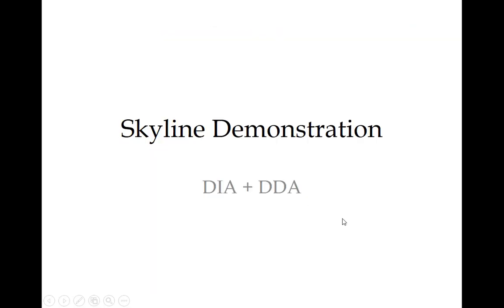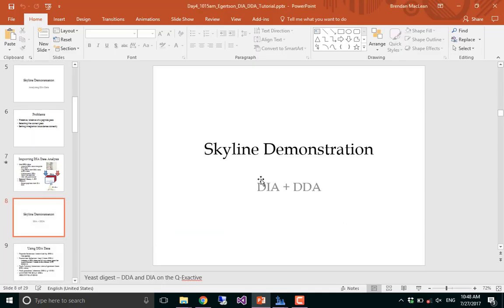Okay, so now we'll jump into it. I want people to start following along as we click through this. Everybody should have successfully transferred the DIA folder from the USB stick onto your hard drive. Please make sure you're working off the hard drive, or else this will be really slow.